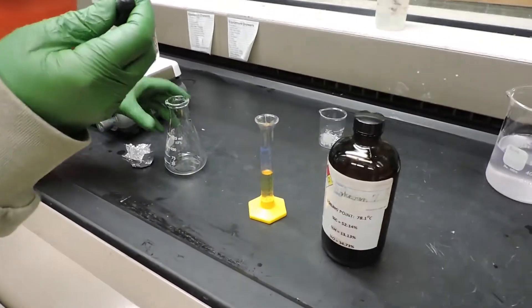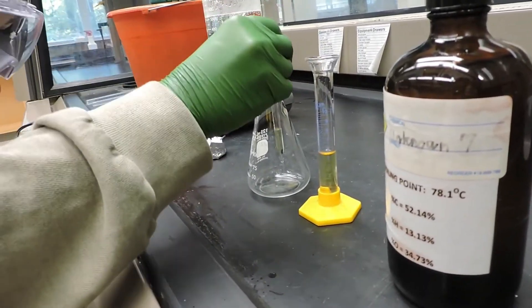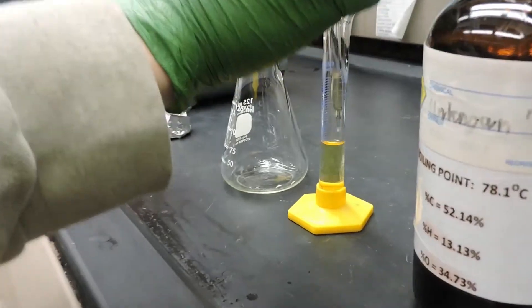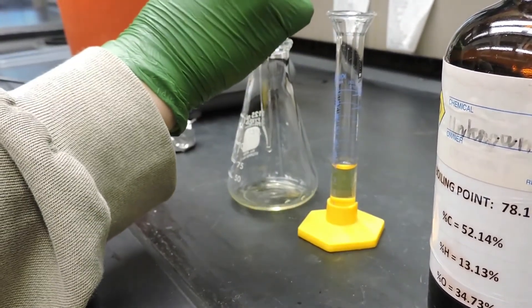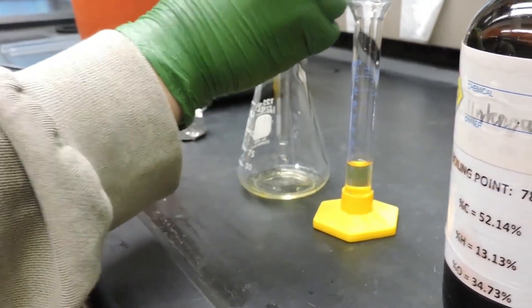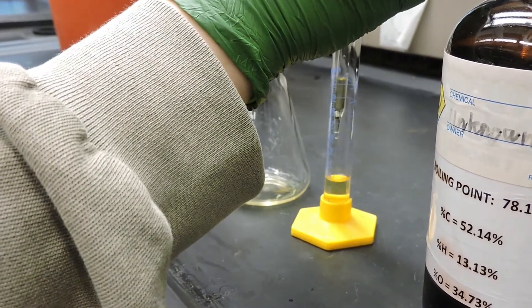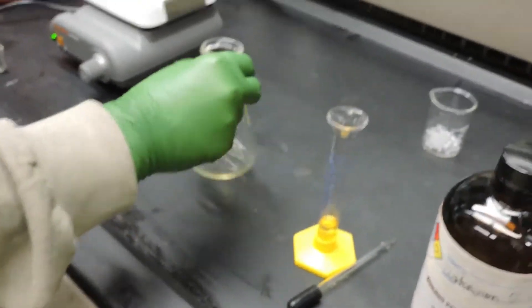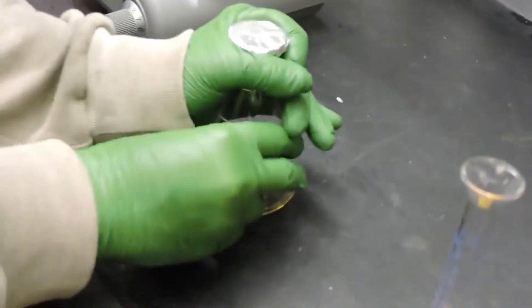We'll take our unknown liquid and introduce it to our pre-weighed Erlenmeyer flask. Now that the unknown liquid is in the flask, we'll cover it with our aluminum foil and poke a hole in the top to release excess vapor as we heat it in our hot water bath.